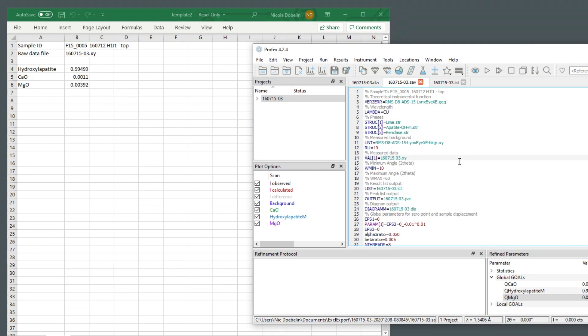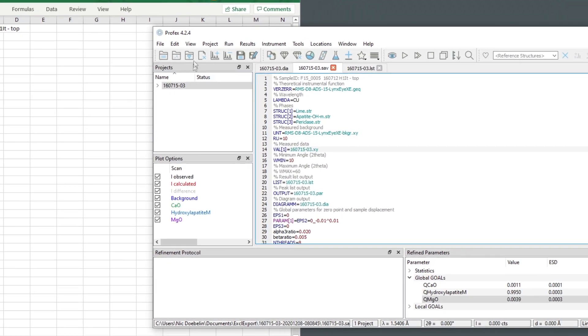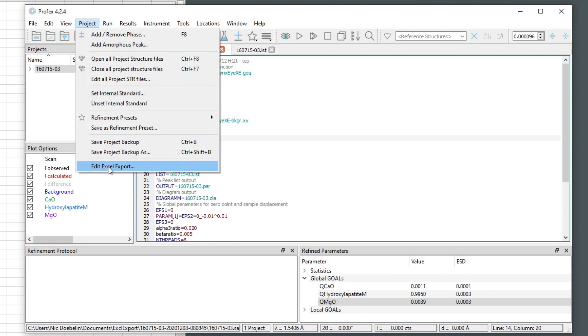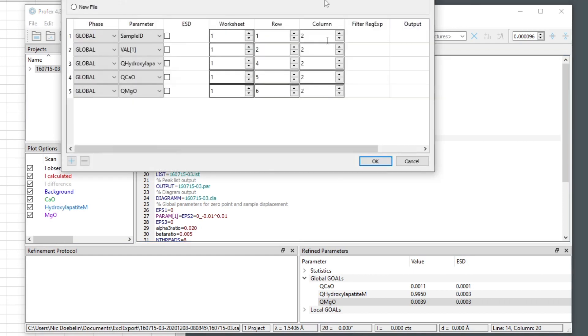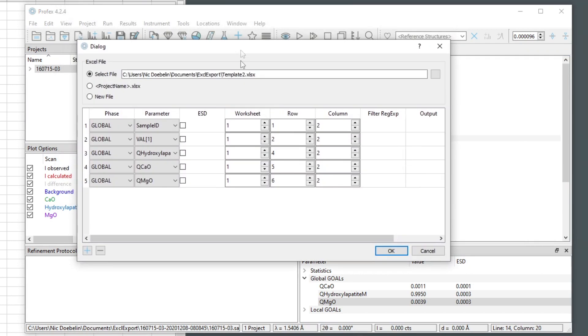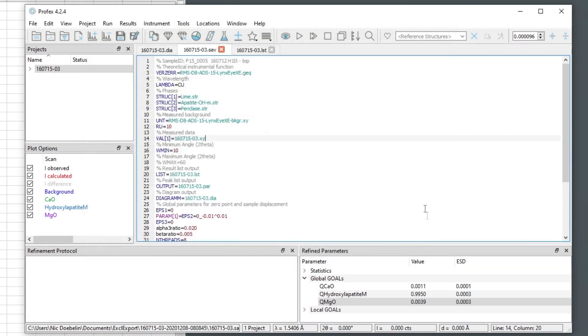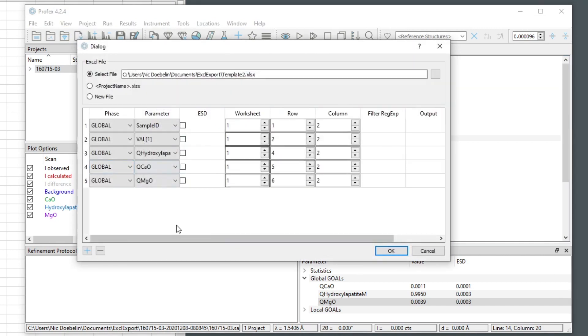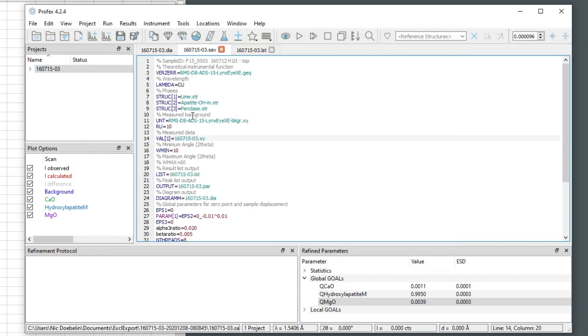This configuration for the Excel export is part of this project now. We can go to project, edit Excel export, and open the dialog again with the configuration. But it is not saved with the project. So if we close this refinement project now and reopen it again, or if we close Profex and reopen it again, this information will get lost. The dialog will be empty again. If we want to save the export configuration, we have to save it as a preset.